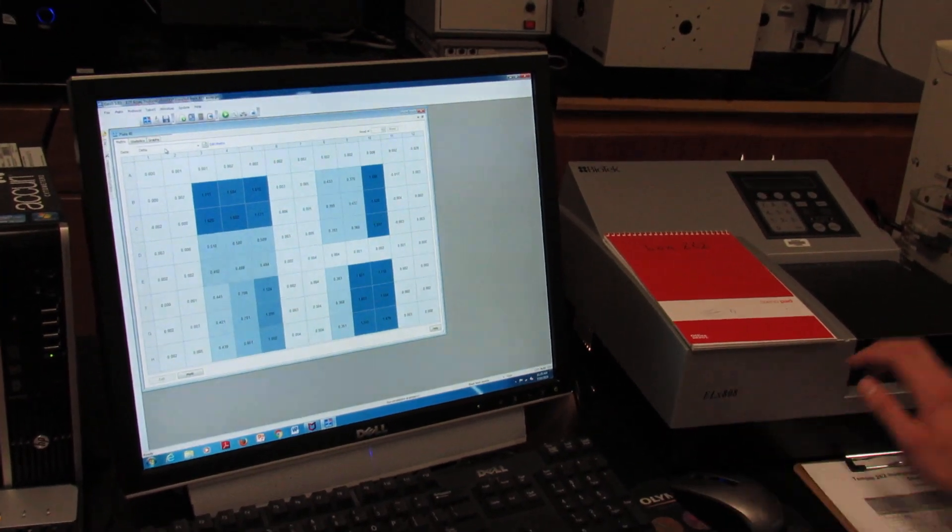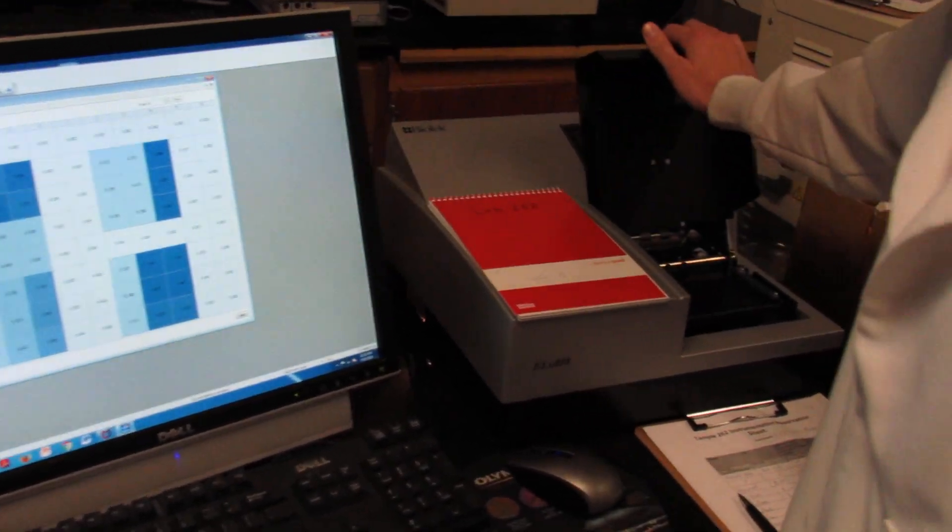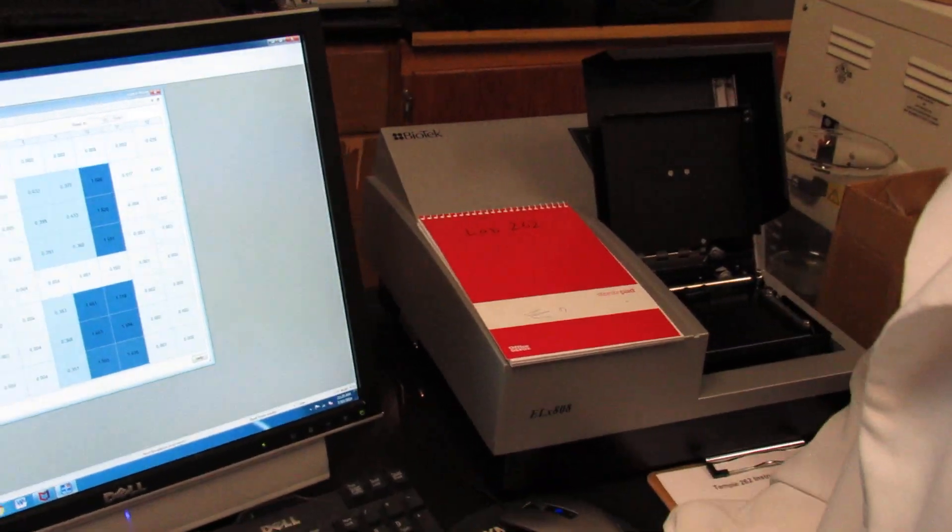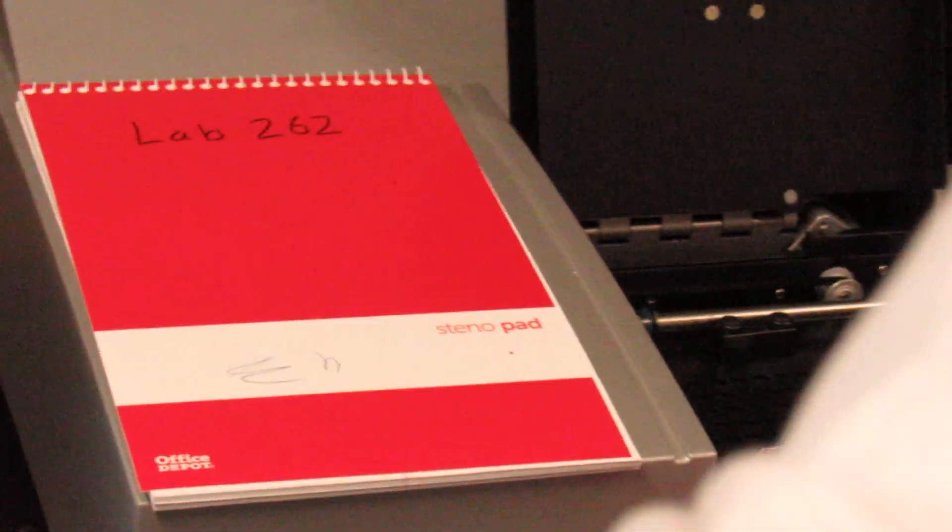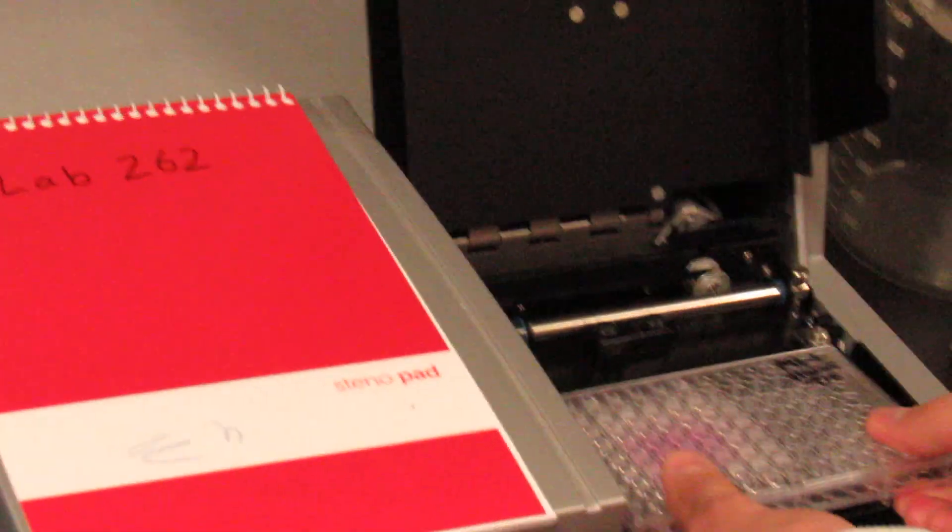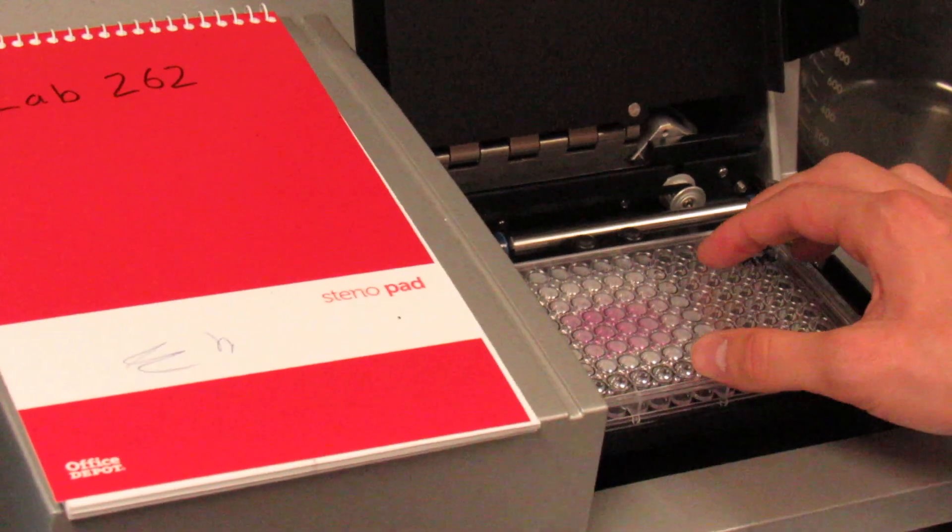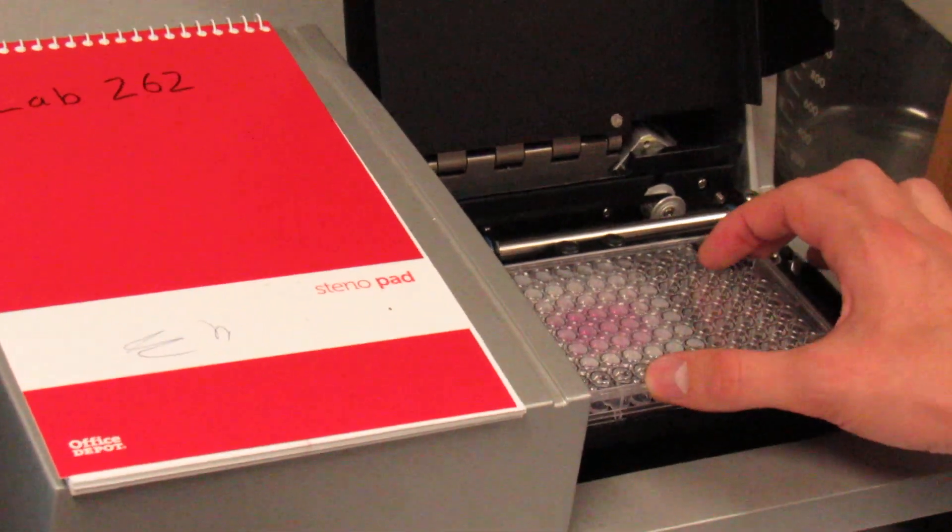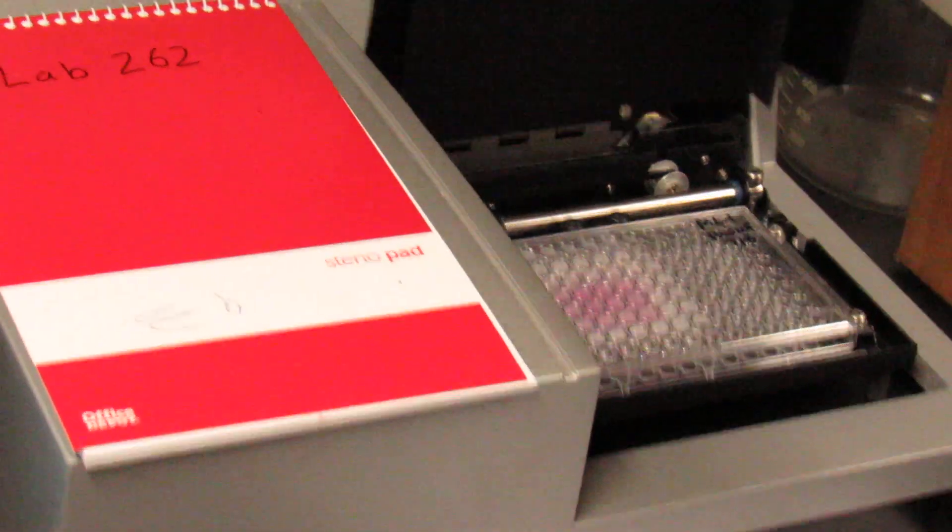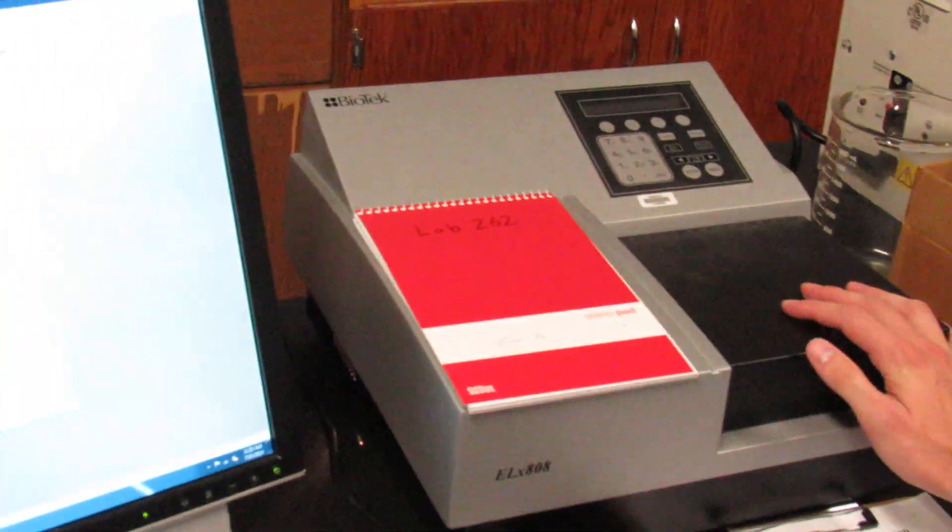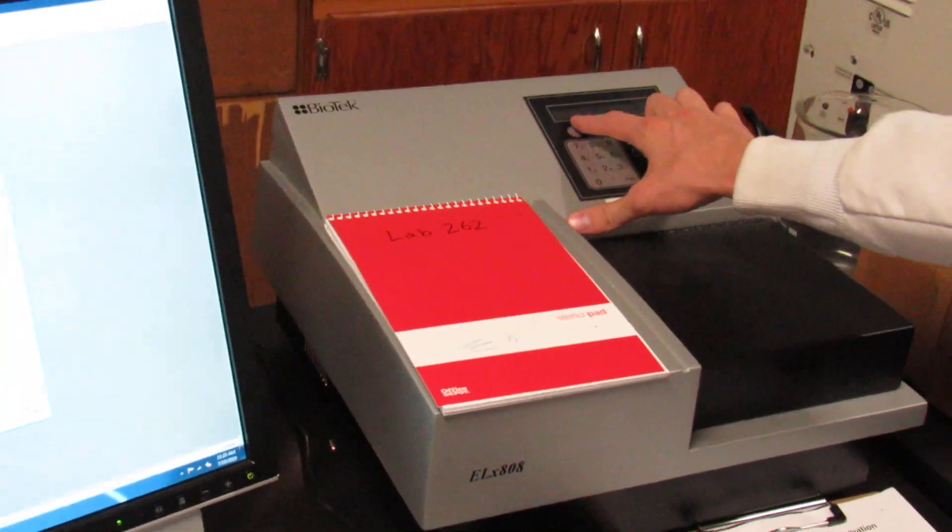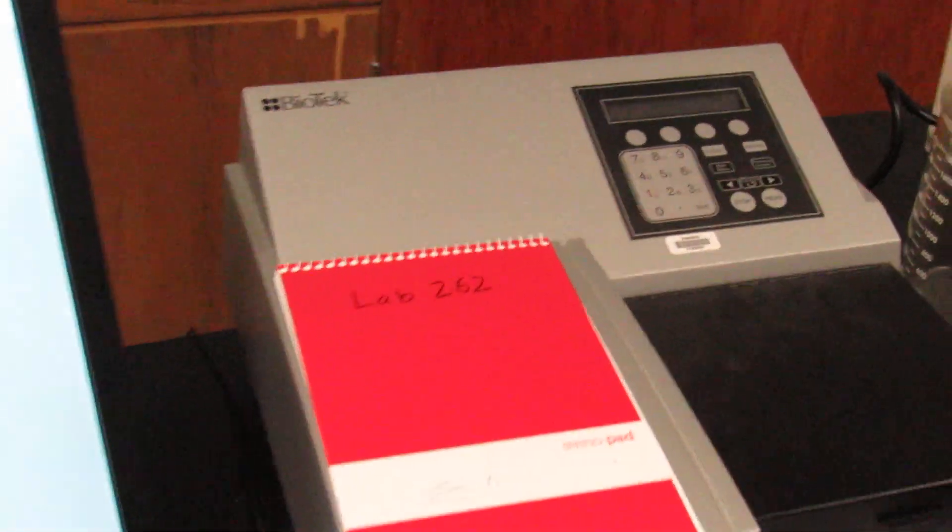While you're waiting for it to start up, you can open the door and you can set your plate in here. You'll just slide it on the plate reader like so. Make sure that the lid is still securely fastened and then you will shut it. You will wait until the plate reader says ready before you can start.